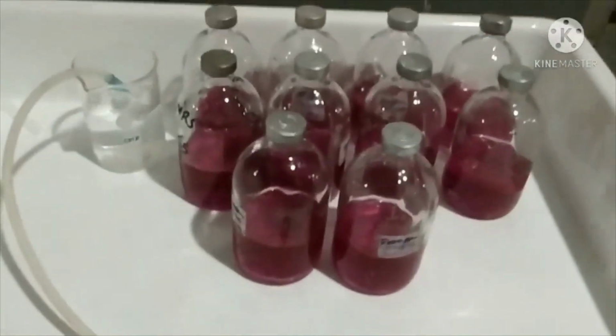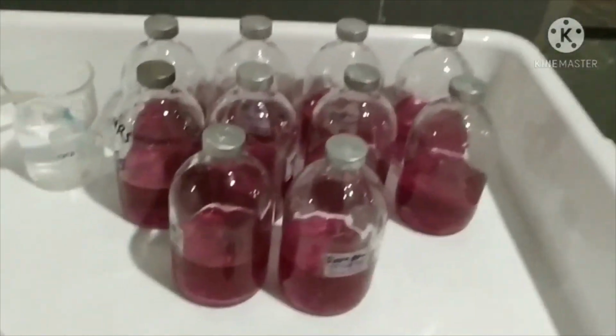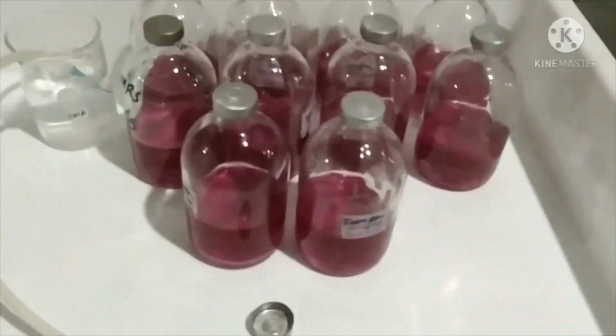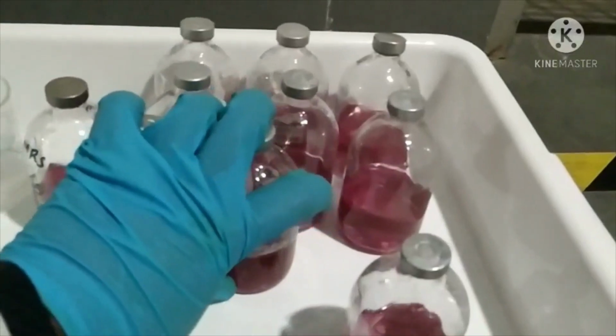We are now going to start the CO2 purging by this line, and all the serum bottles we have prepared are red in color. So we will take one and then start.